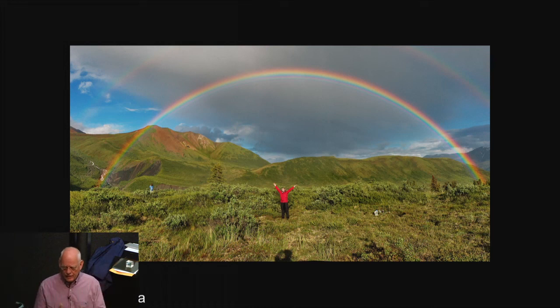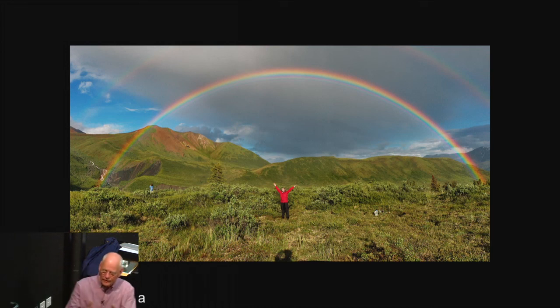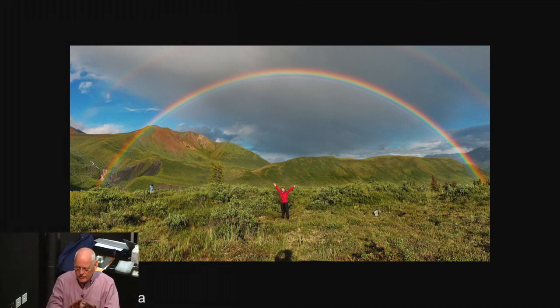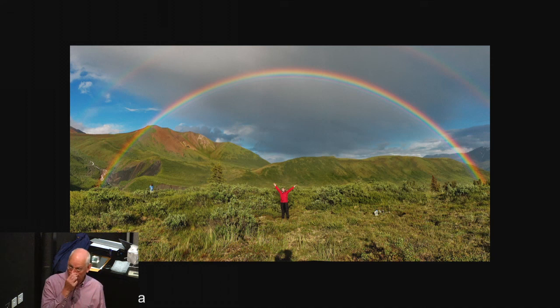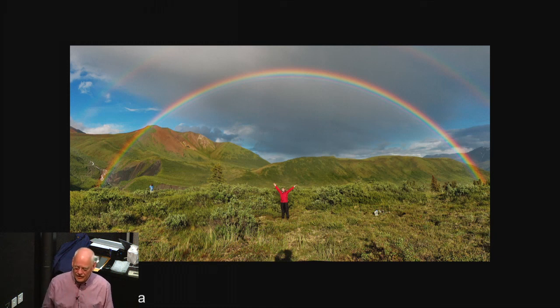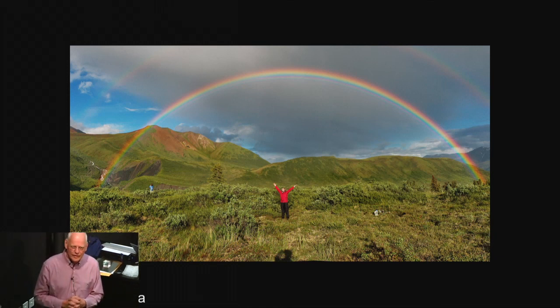So you're thinking of changing the perspective, and as we move, we can accumulate that type of information to improve resolution? Yeah. Or just from the sample itself, if there's a time-dependent change. Yeah, in a way, the sequential settings that we go through mimic that type of resolution, where you average over time, get different information, and combine that in polarized light imaging.